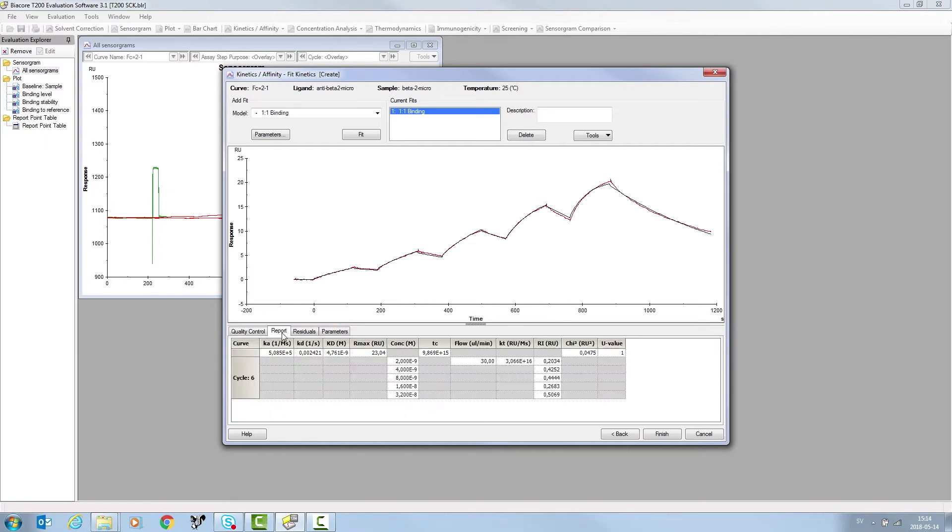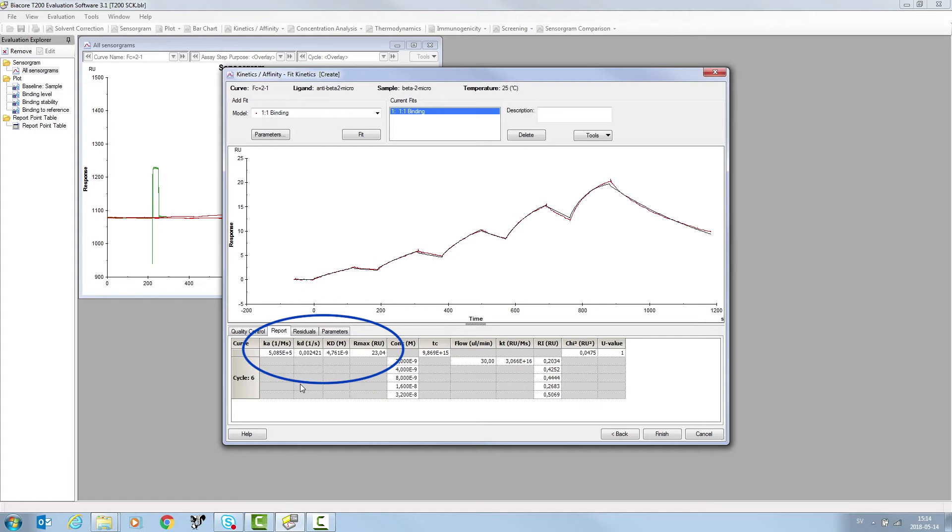Click on the report to see the reported kinetic and affinity parameters. In the report tab, the association, dissociation rate constants and affinity constant are displayed.